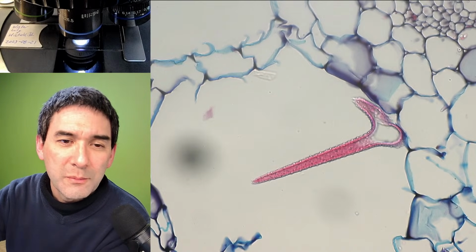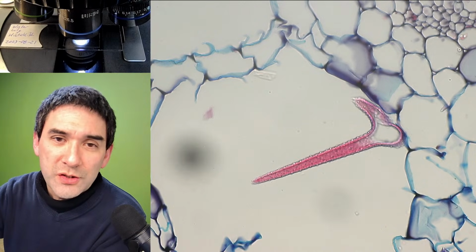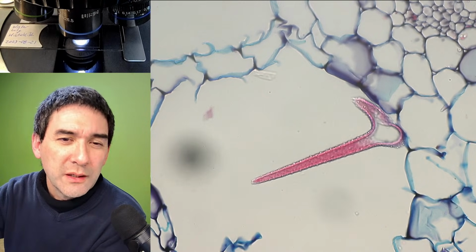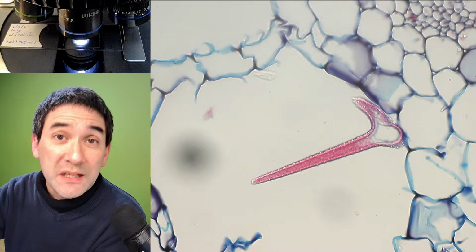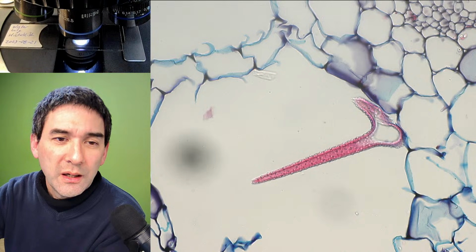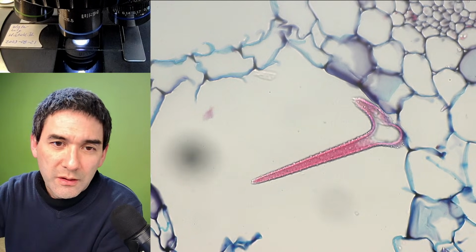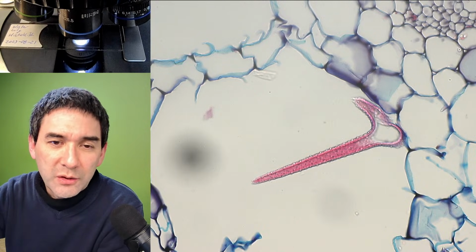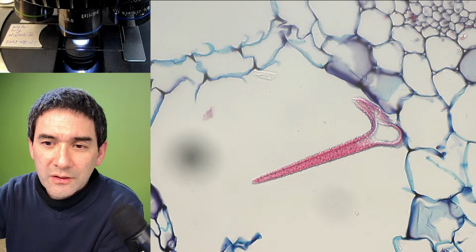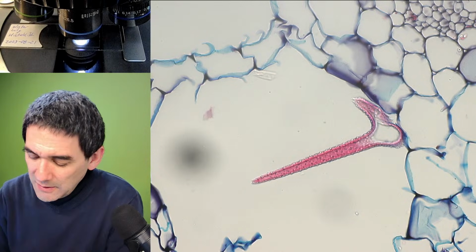Yeah, and these are basically these crystals that are forming on the inside. And I did a little research because I wanted to know what they are doing. There seem to be two possibilities. Either it's some kind of protection against being eaten, and or basically it's calcium storage. So if there's too much calcium, then it will simply store it in those crystals here. Yeah. And let me have another one.